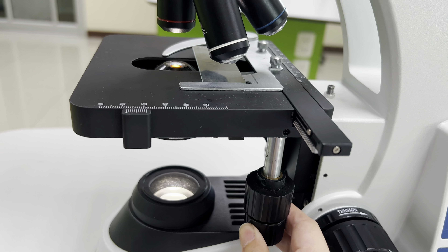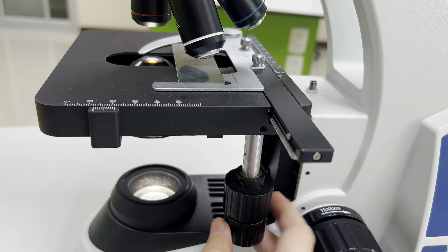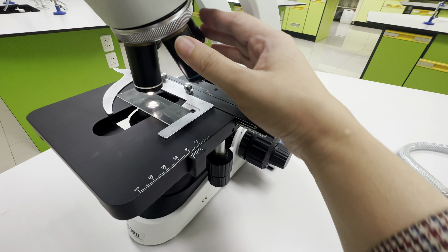You can view the specimen by moving the slide and turning these two knobs. One moves the slide back and forth, and the other moves it left and right.